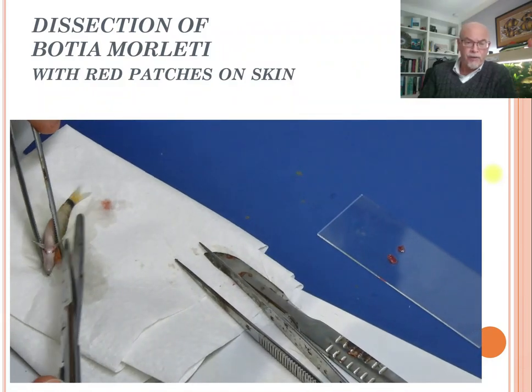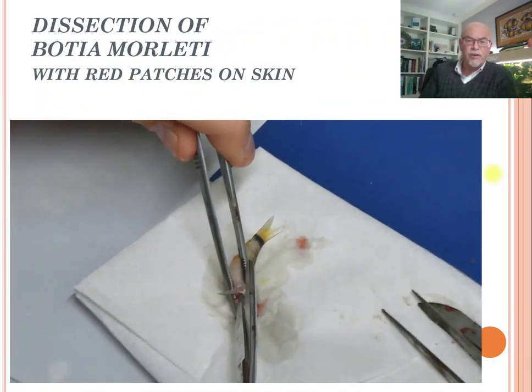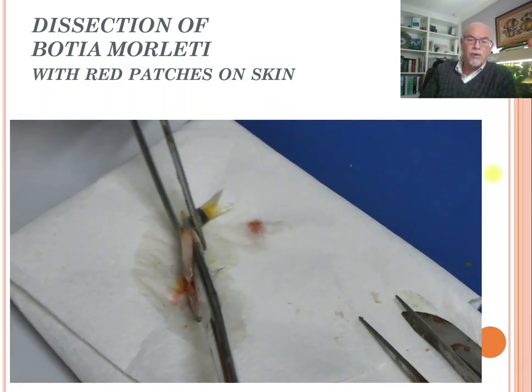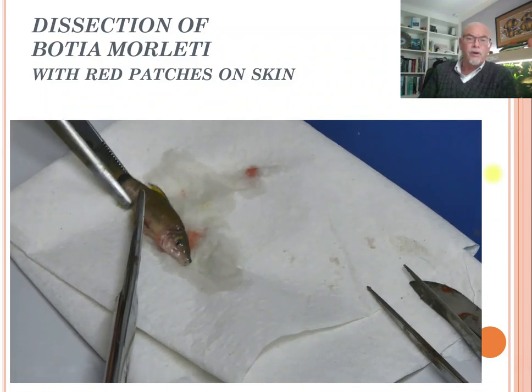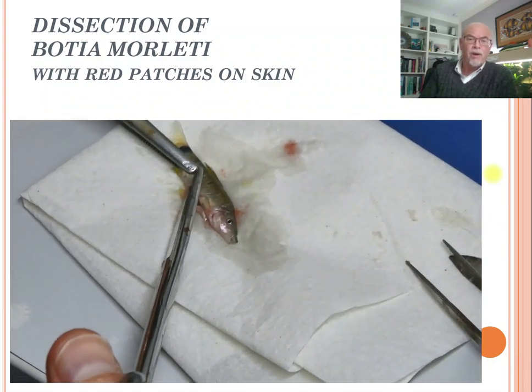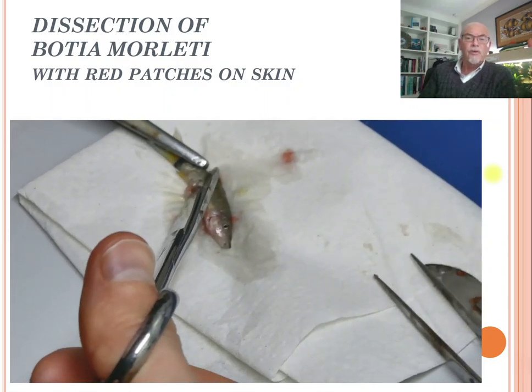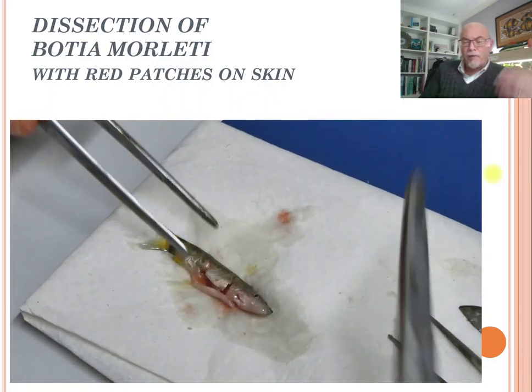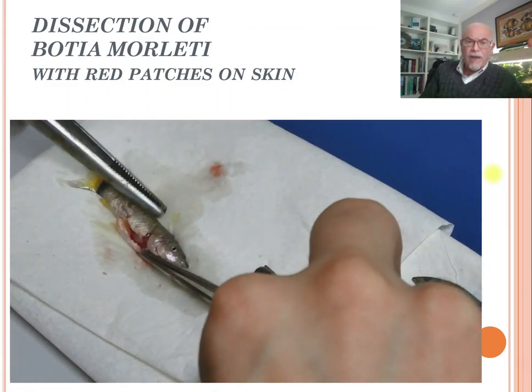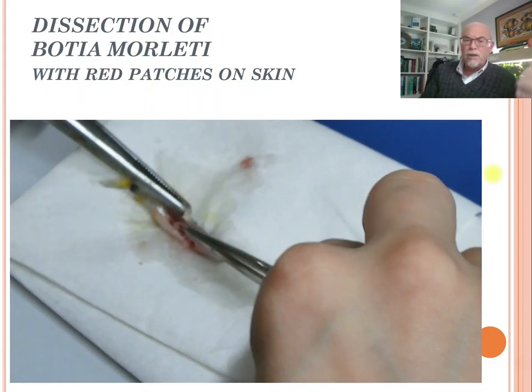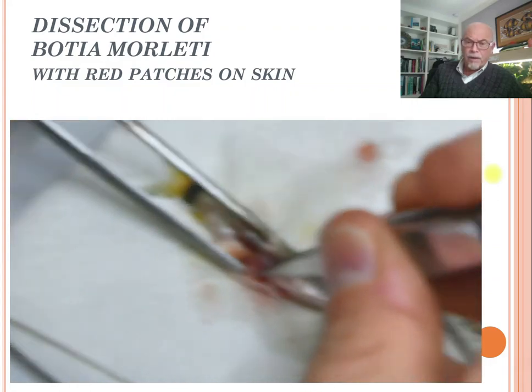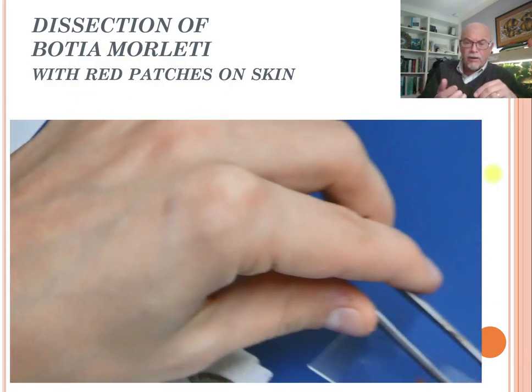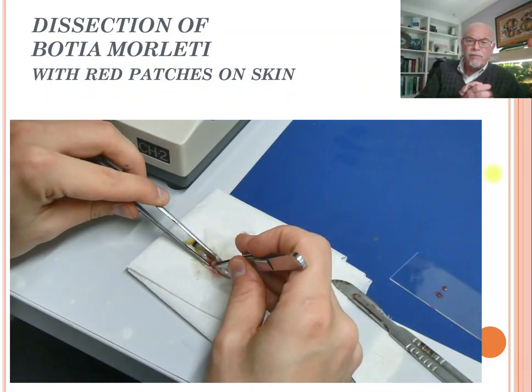Now he's opening up the fish by doing a dissection with scissors — a very simple method where he starts up front and cuts carefully so he's not damaging the internal organs. Now we cut away the flap of skin tissue and muscular tissue so he has a free view of the organs to examine. A full examination of a fish covers the skin, the gills, and the internal organs — which are usually the intestine, the spleen, and the liver.